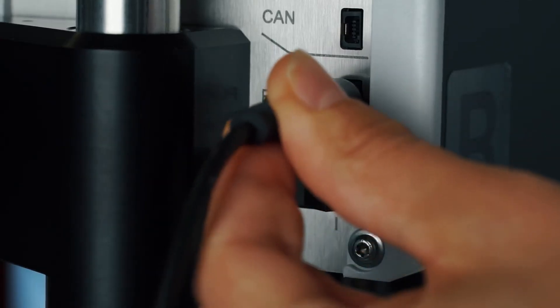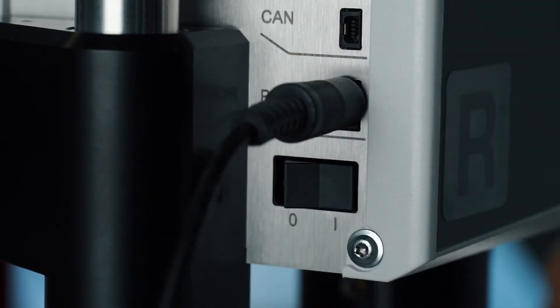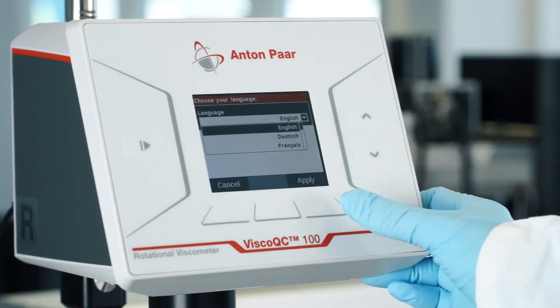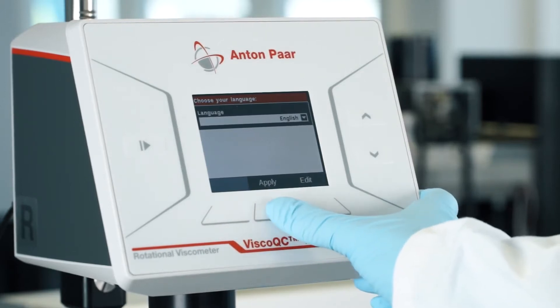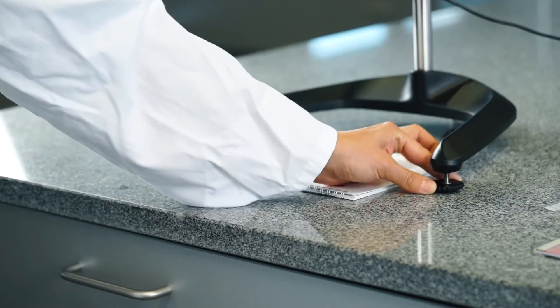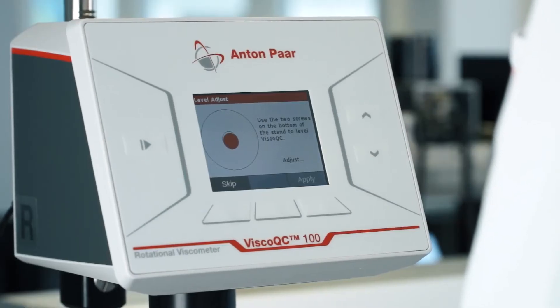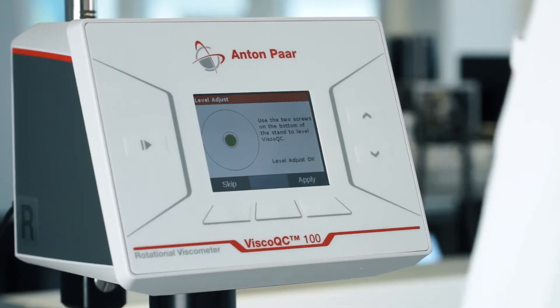Plug in the power cord and turn on the instrument. Select your desired language. Now you need to adjust the level of your instrument by fine-tuning the right and left screw on the bottom of your device until the circle on the display turns yellow and, as soon as stabilized, to green.